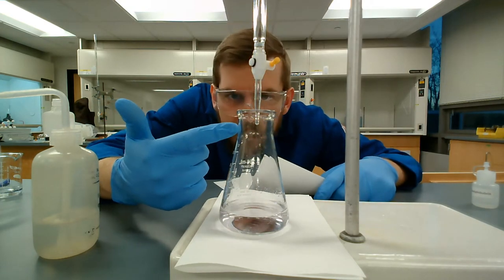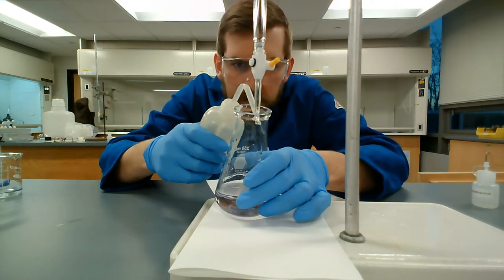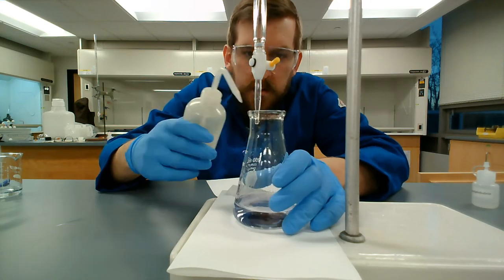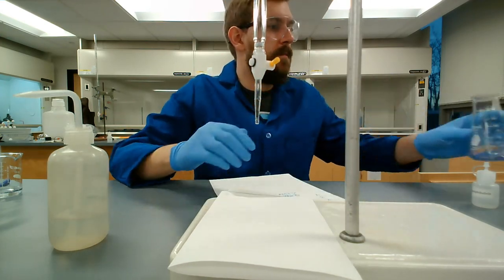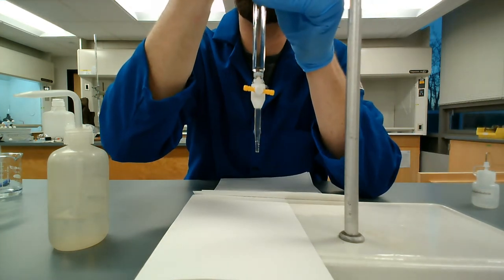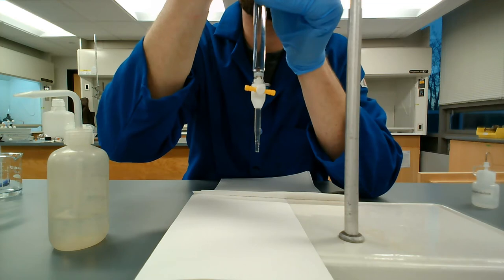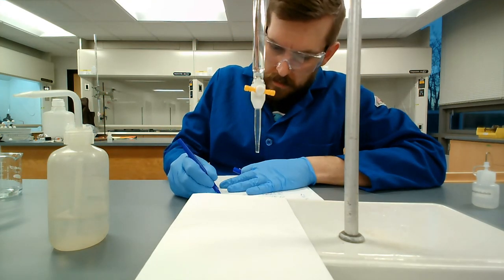Right. There's still a tiny smidge of a drop that I've dispensed, so I want to tap that in and rinse it. Make sure all of that stuff gets on the bottom. Anything you dispense should be in the bottom of the flask in the solution. Right. Record my end volume here real quick. Refill my burette. Then we'll get on to the third.